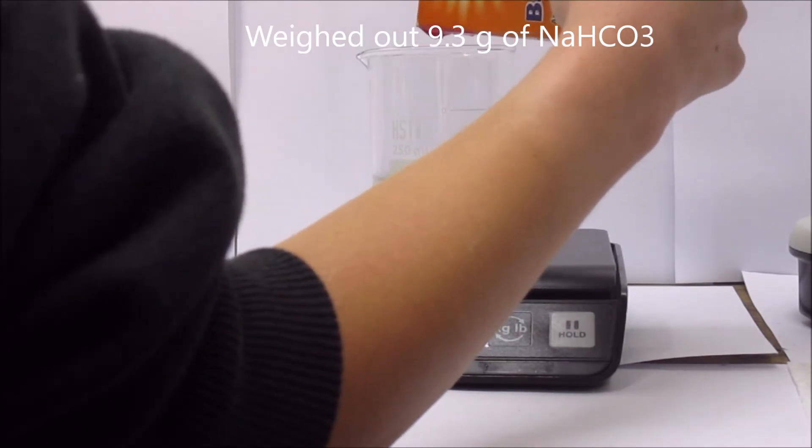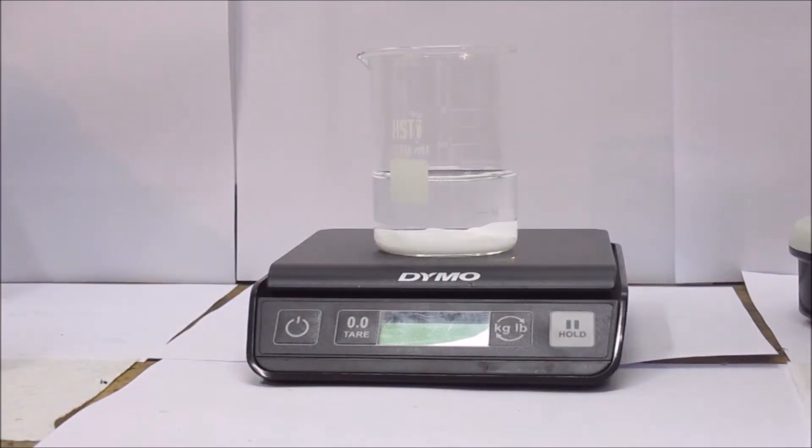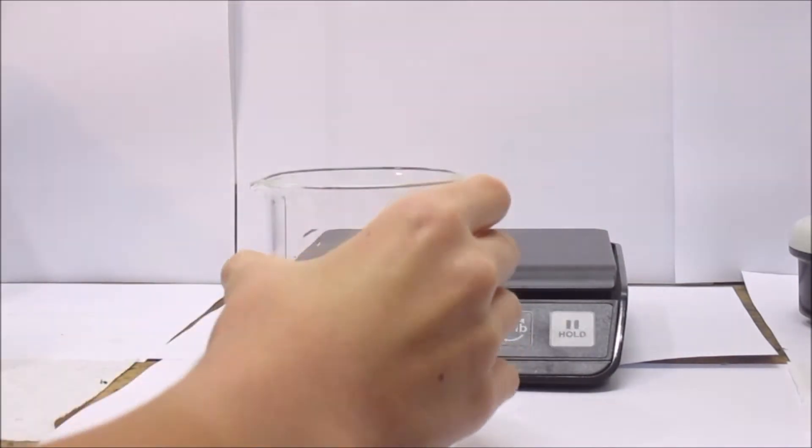Then I weighed out 9.3 grams of baking soda. After I completed that, I took it off the scale.